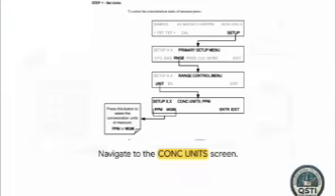Luckily, navigating the T200H and T200M interface is highly logical. Starting from the main sample display, you just hit Setup. That takes you right to the primary setup menu. From there, select RNG to get to the range control menu and hit Unit. Boom, you're at the Conc Unit screen. It's a super simple toggle. Just press the button to choose either ppm or mgm, lock it in by pressing ENTR, and you are ready to keep moving.